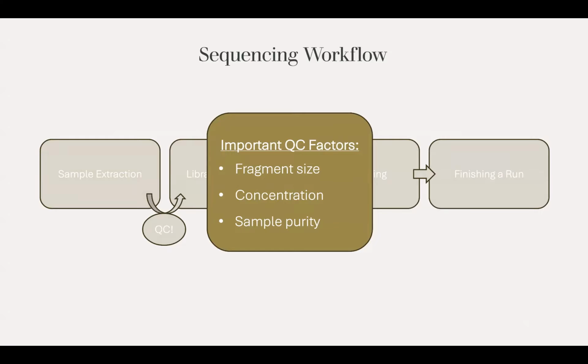I'm sure many of you have heard about this instrument before. You can check DNA and RNA integrity and quantity. So here you see this RNA integrity and quality number. 7.1 is on the lower end of what I would ideally sequence. It's a 0 to 10 scale, where 10 is a perfectly non-degraded sample of RNA. 7 is sort of on the lower end here, so I don't believe that I went through sequencing this sample, but it's really nice because the Qubit can tell you the breakdown of small and large RNA in your sample.